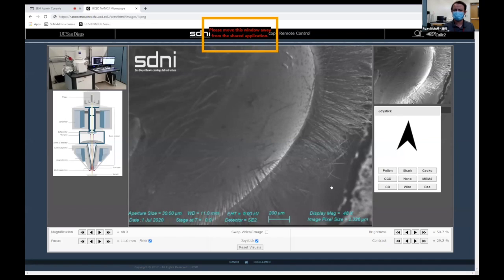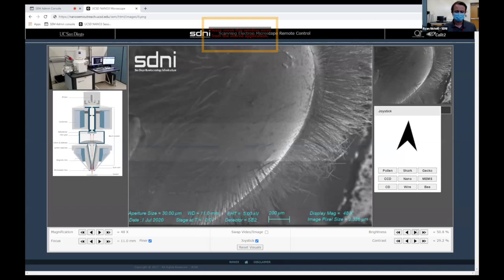So for example, if you have a heavier nucleus, you would expect that element to scatter more electrons. So therefore, the brighter points in that image may be attributed to a heavier element and so on. So the answer is not clear cut. It's a very difficult question to navigate, and usually requires a couple of lectures in undergrad.